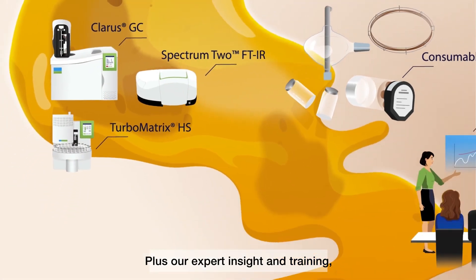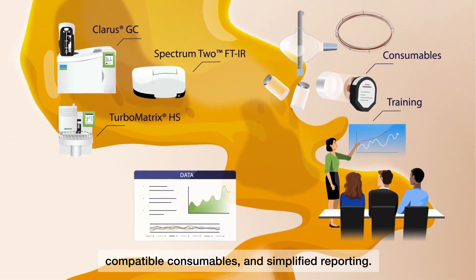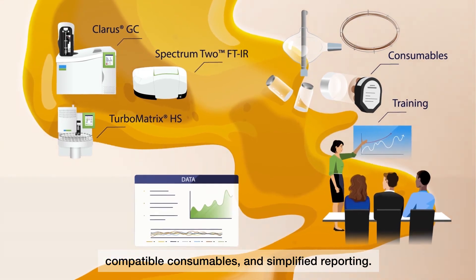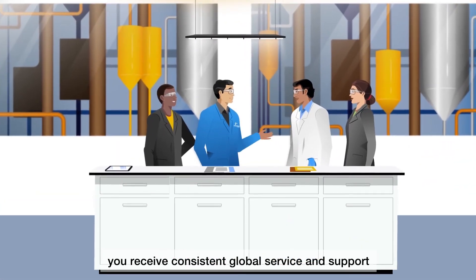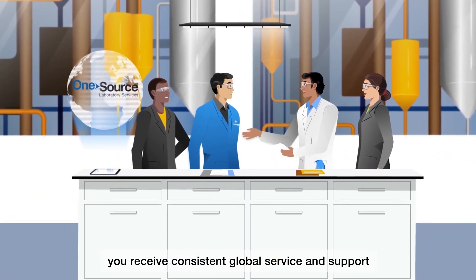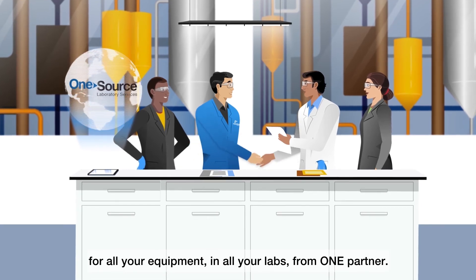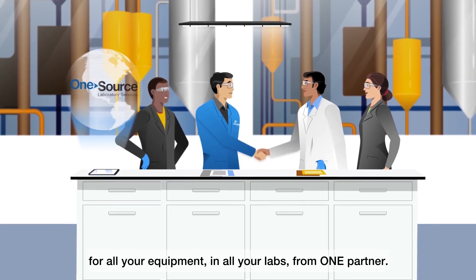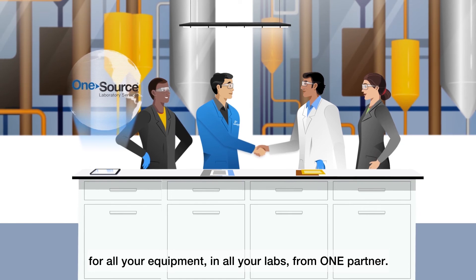Plus, our expert insight and training, compatible consumables, and simplified reporting. And with PerkinElmer, you receive consistent global service and support for all your equipment, in all your labs, from one partner.